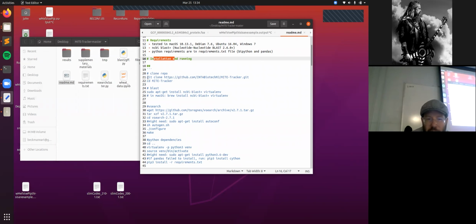So it looks like these are some commands. It's saying, for example, in order for me to run this, a prerequisite is I'm probably going to have to download these dependencies. So let's try to do this. Wait. This I think we already got. This was literally what I just did. So here's the other thing when you're trying to install this stuff: if you're just not familiar with computer science, sometimes you'll end up doing things multiple times because there are different ways to approach it. But okay, we already did this because we cloned the repository. That was when we downloaded the file.